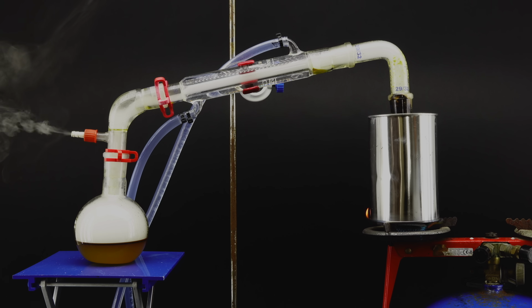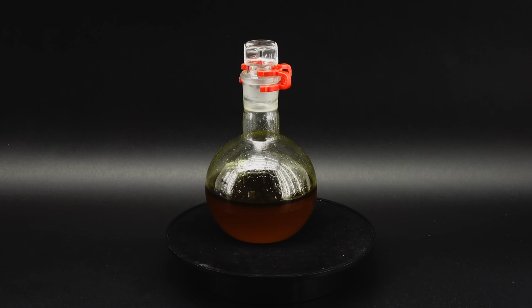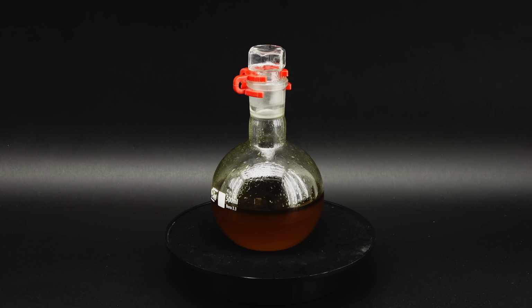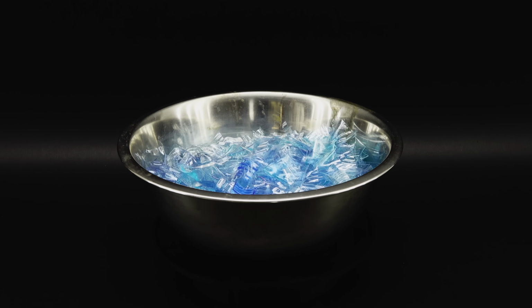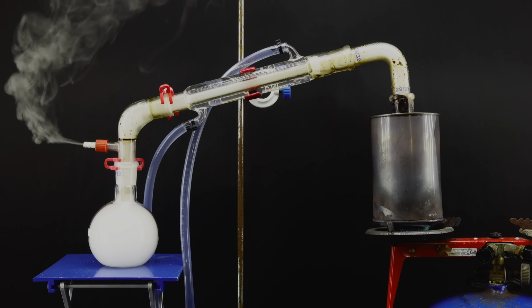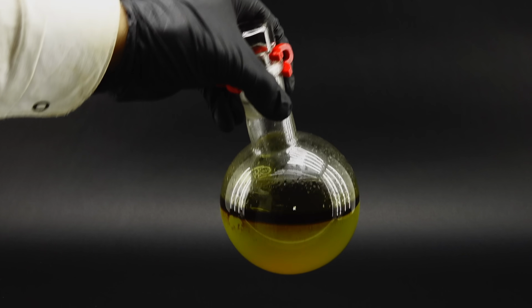Distilling it went much smoother than before, with no awful foam being present and a bunch of benzene coming over. Together, these distillations left me with a flask containing a pretty decent amount of benzene, and before purifying it, I repeated the whole process again to take care of all the plastic I still had laying around. With so much new wisdom and smaller urges to go for a snack, it wasn't as painful as before, and after only half a day of work, I had a second benzene-containing flask ready.